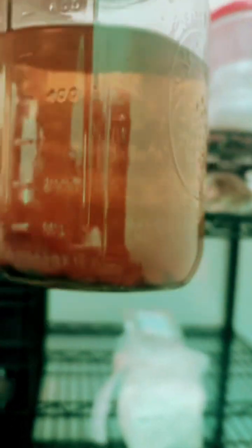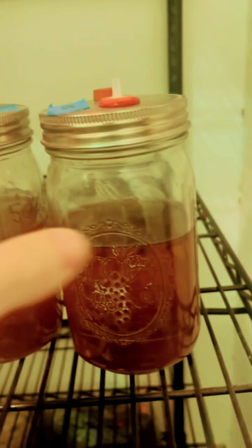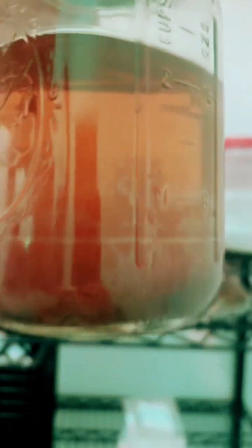This one right here is looking very dire. Nothing's really growing in there. I think the mycelium is really struggling with that amount of sediment and 100% right here. So not doing great either.